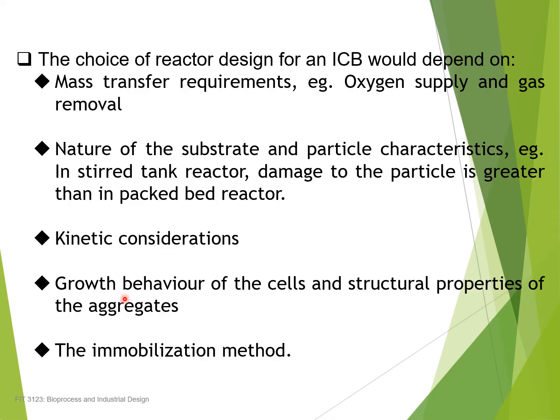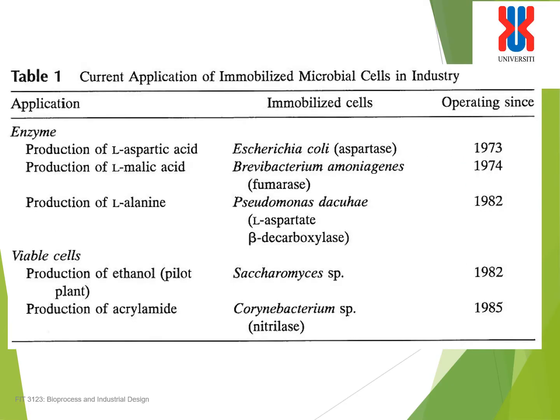The fourth one is the growth behavior of the cell: when is the lag phase, when is the log phase, when is the exponential phase. You need to focus on that, on how long it takes for optimum enzyme activity. Also the immobilization method. As you know from your previous slides, immobilization methods can be passive and also active.